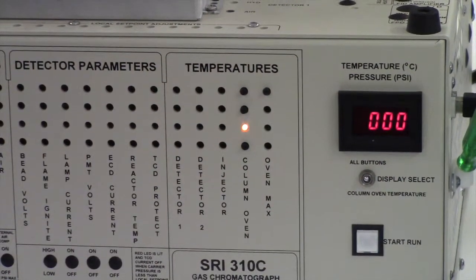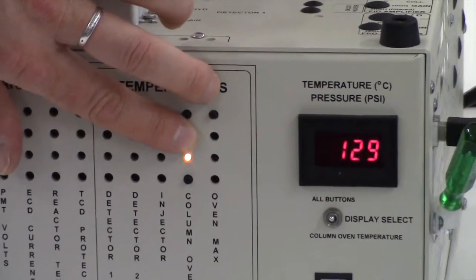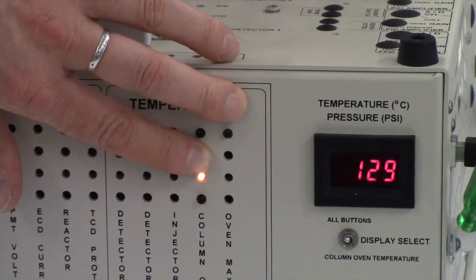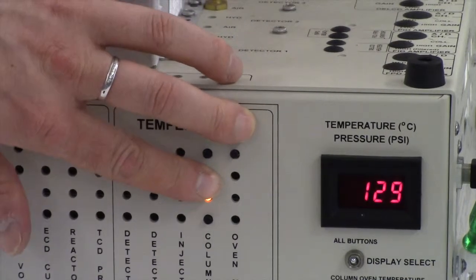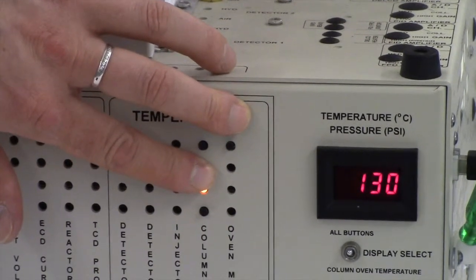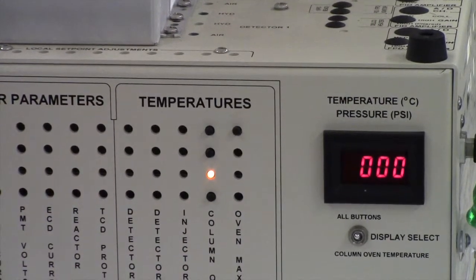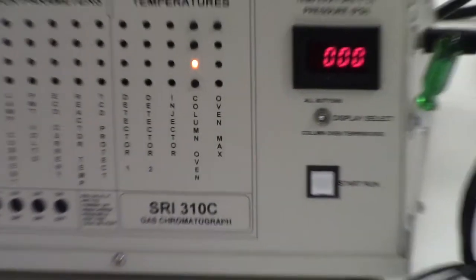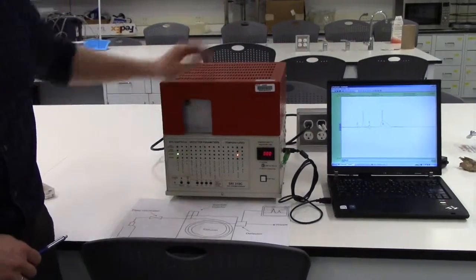And then we have the set point, which is set, again by the software, as a starting point of 130 degrees centigrade. And again we have the start button, and a safety switch there, so we cannot operate.